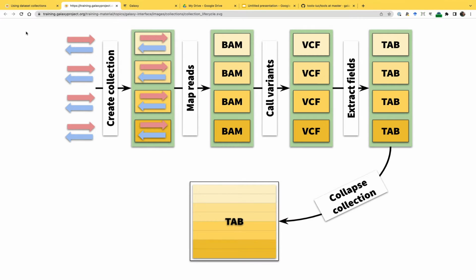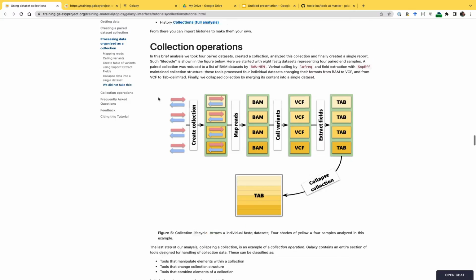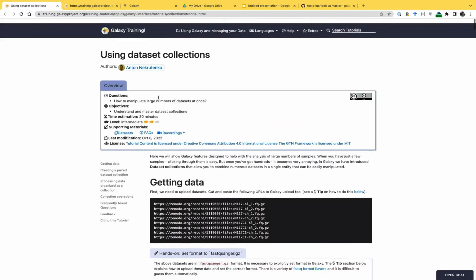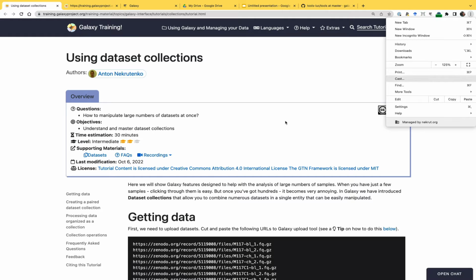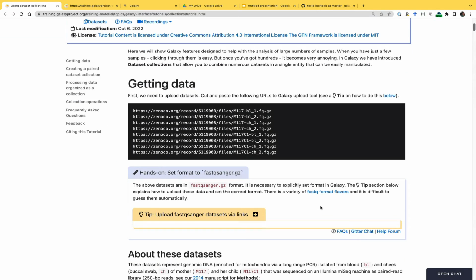Okay, so that's the idea. I'm gonna more or less follow this tutorial. I sent a link to this tutorial in that email as well. But more or less, it's a jazz performance, not classical music. So we're gonna deviate. We're gonna interpret it. So here's our data. That's kind of the interesting thing. So let's load it up.